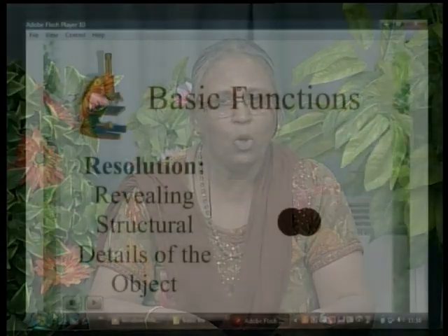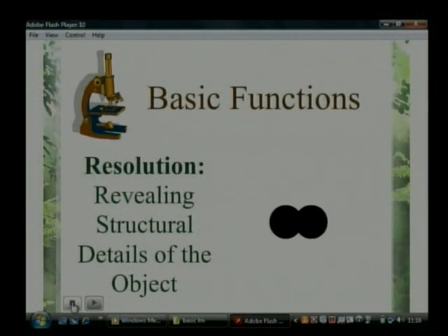They should be seen clearly as separate objects, and this will be very clear in the next slide, where objects lying very close to each other are initially seen as a single object, but with good resolving ability of the microscope, they can be seen as two separate objects.